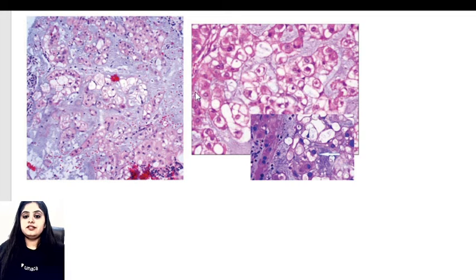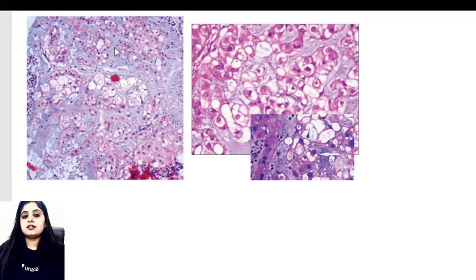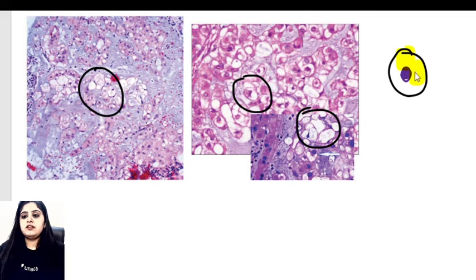If I highlight these cells — it's all about the cells — there are two things I'm seeing here. First and foremost, I'm seeing a lot of bluish color material, which could be something like a mucin or a mucopolysaccharide. But what is more characteristic than that are the cells. At higher power, I can analyze that these cells have a nucleus like any other cell, but apart from that, the cytoplasm is very vacuolated and bubbly. That is how you are going to define it.